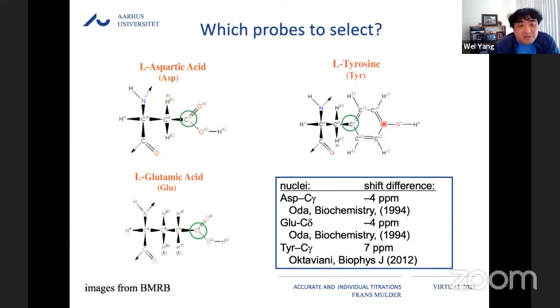You mentioned how the chemical shift and pKa shift may happen. Indeed, I think the field has really been looking into the ones which are very functionally relevant, which may involve conformational coupling. Have you seen any of these? When we change the pH, the protein will change conformation. Whenever you change the chemical state, a conformational change happens, and then quite a bit of signal will show up afterwards.